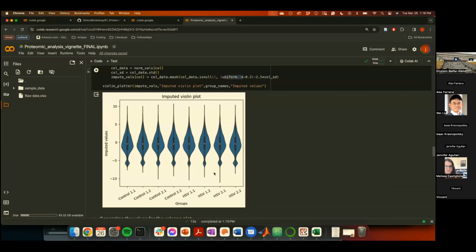We cannot really calculate that. The test to use to check whether a distribution is normal is the Shapiro-Wilk. There's probably a function in Python that you can use. It doesn't really work when you have so few data points. So yes, using the t-test is an approximation, but it's the only one that has enough power to deal with so few data points. I think that's probably the question.